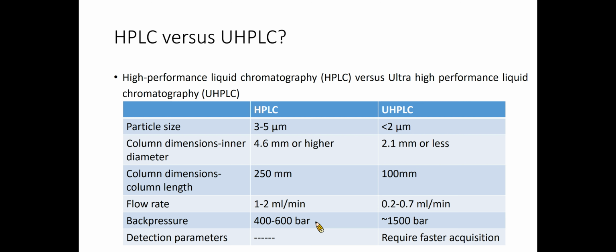Narrow peaks are produced with a UHPLC, requiring a detector that can keep pace and provide the required number of data points per peak for detection. Most modern detectors, though, are capable of detection speeds of up to 250 Hz, which is sufficient for both HPLC and UHPLC.